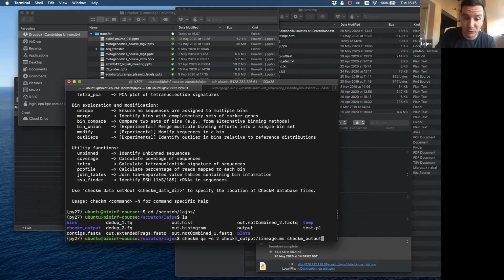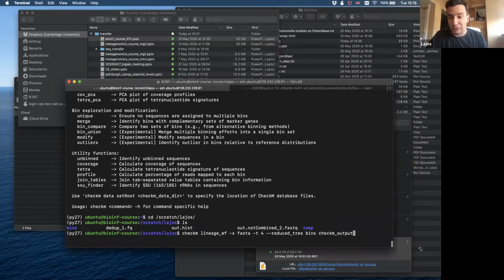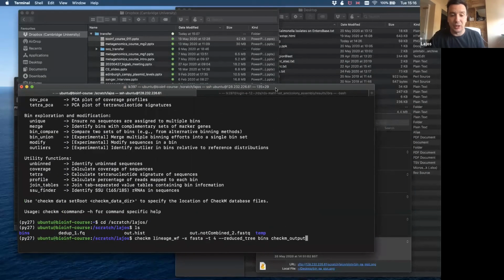there will be a lot of different CheckM commands we will run later on, but this is the main command we will first run. So your first CheckM workflow should always be this lineage workflow, which means that CheckM will check a lot of things, but also try to identify the taxonomy of your contig or your contig-FASTAs.